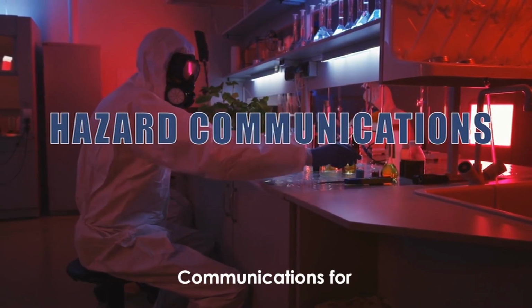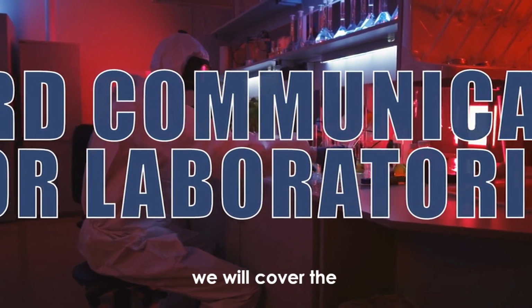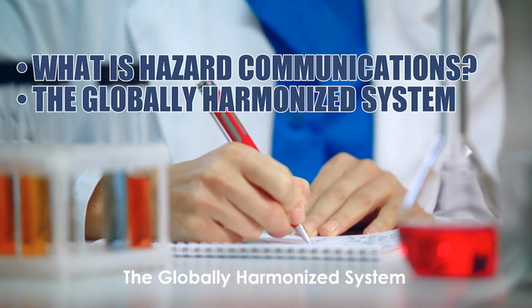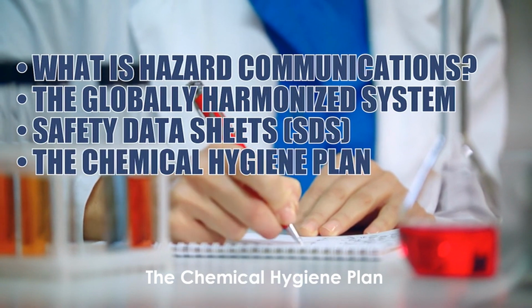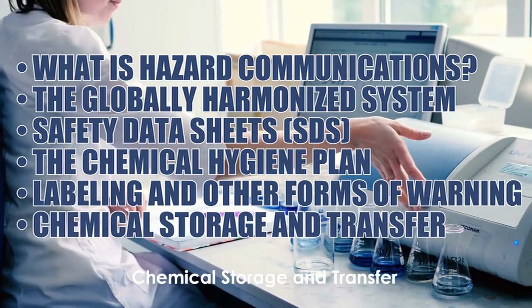Welcome to the Hazard Communications for Laboratories Safety Training. During this course, we will cover the following learning objectives. What is hazard communications? The globally harmonized system. Safety data sheets. The chemical hygiene plan. Labeling and other forms of warning. Chemical storage and transfer.